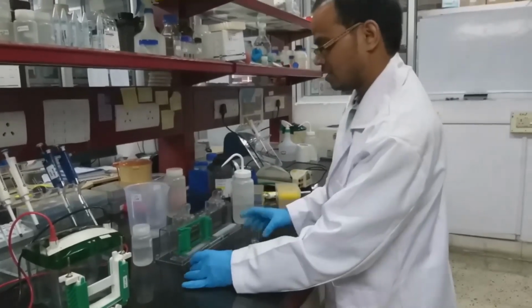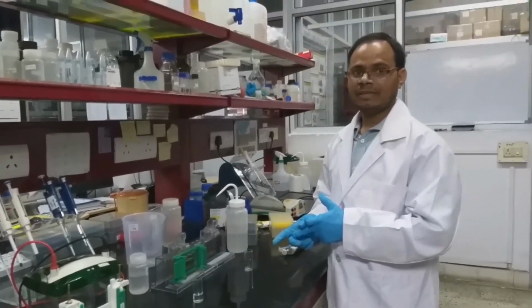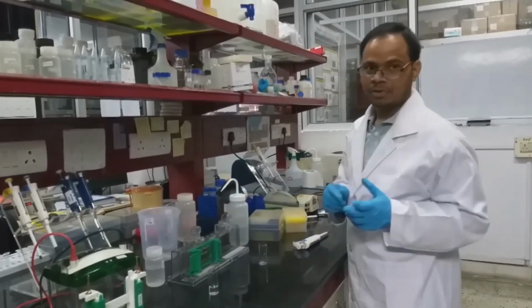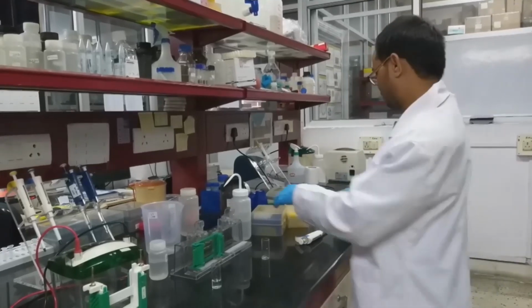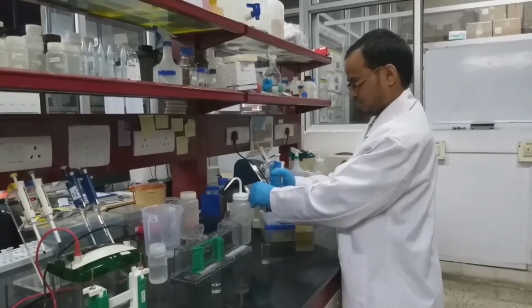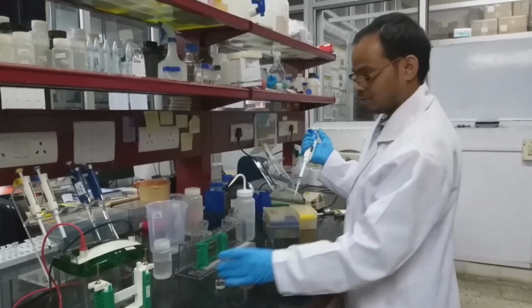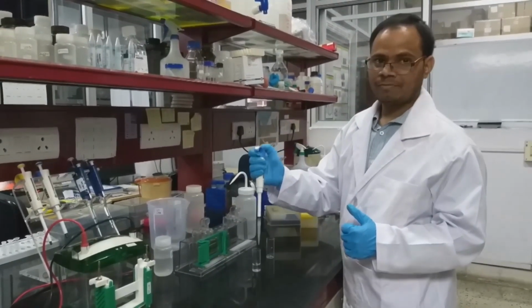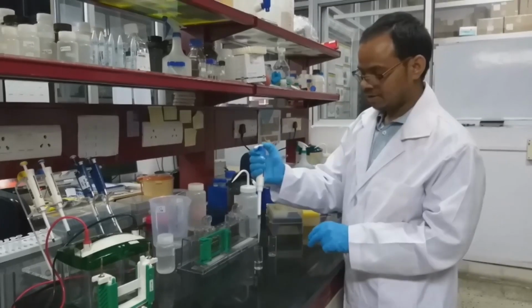So now we will start preparing the stacking gel. The compositions are given in the video. You have to add 3.4 ml of water first.